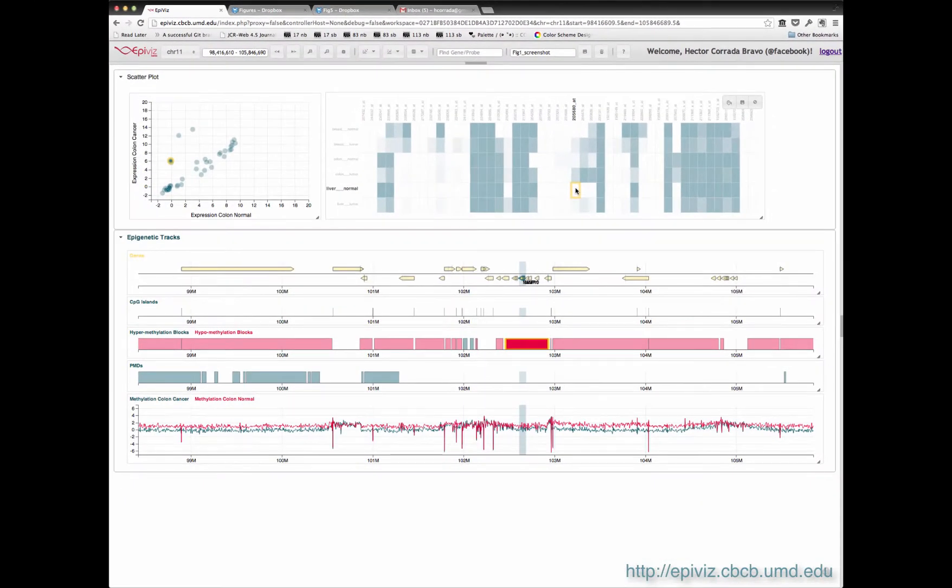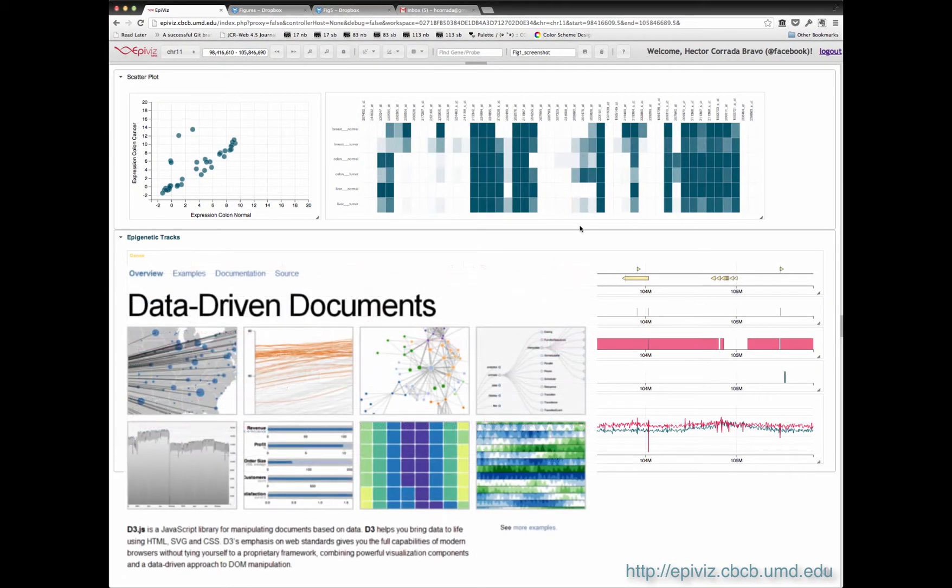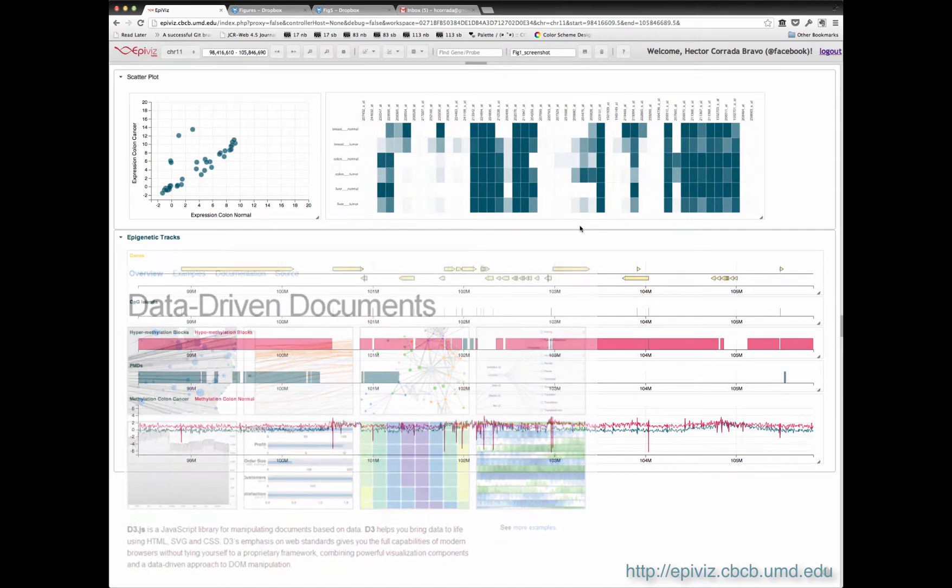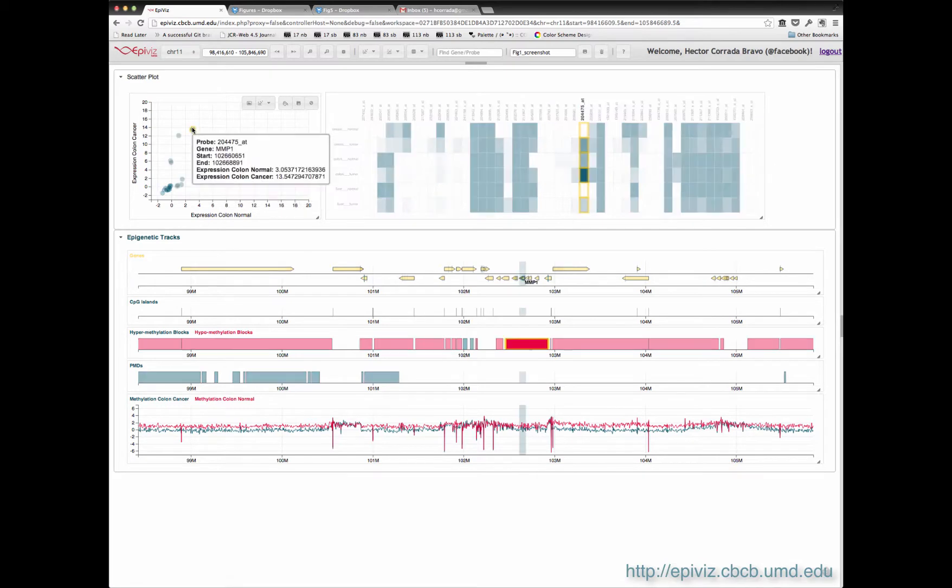We use d3.js for visualization, so visual elements are mapped to data elements. We use that to link data across tracts and plots using brushing.